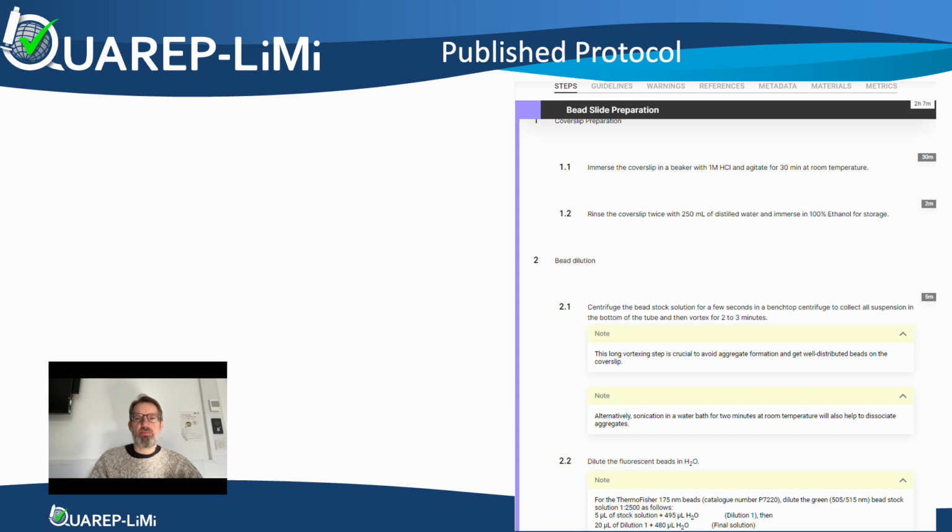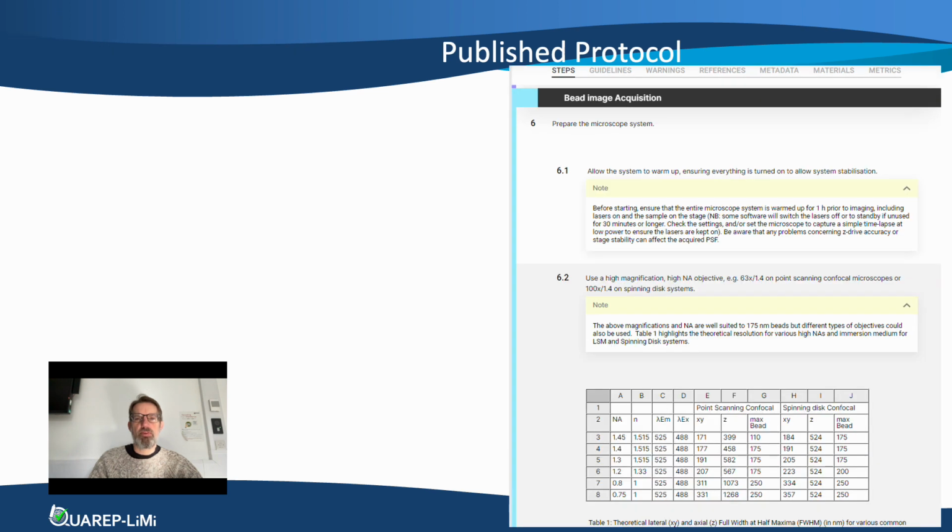We tested some fixed and printed substrates as well as beads, and settled on 175 nanometer green beads based upon brightness, stability, cost, and accuracy. The protocol gives detailed instructions for preparing a robust sample with these.